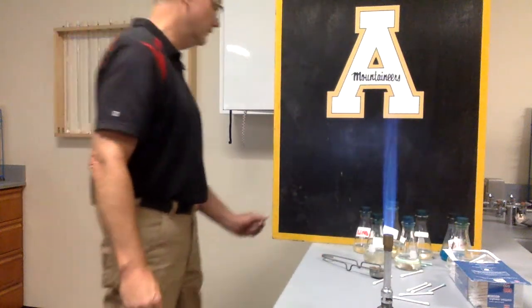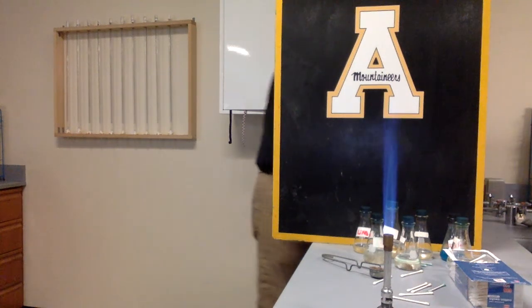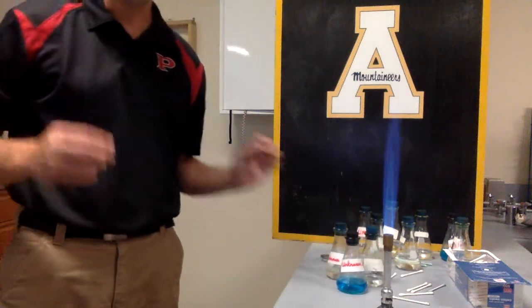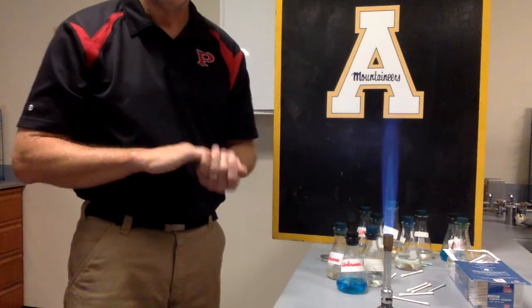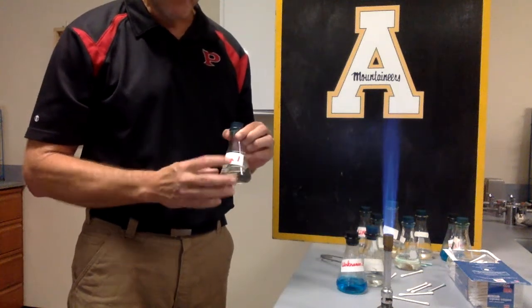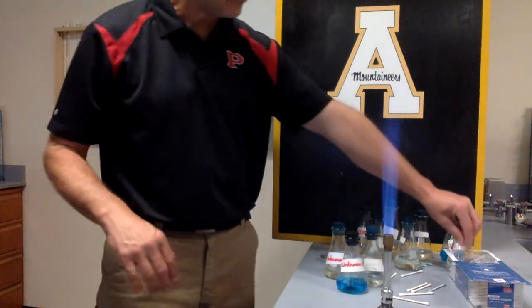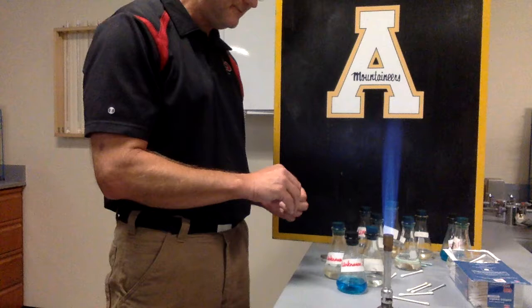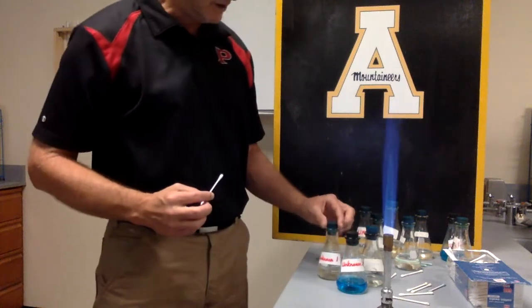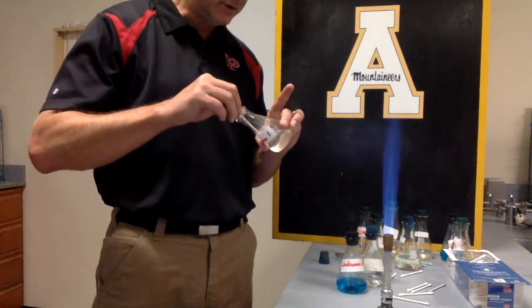Now, what do we do with these? Well, guys, hold on just a second. If you know that all of those are going to have very specific color bands whenever you heat them underneath this, then we can use that to help us determine what unknowns are. So you can go through, and I'm going to pick number 1. And we've got all of these other ones already recorded. That was on page 31 of your digital notebook. You were recording the colors that you saw.